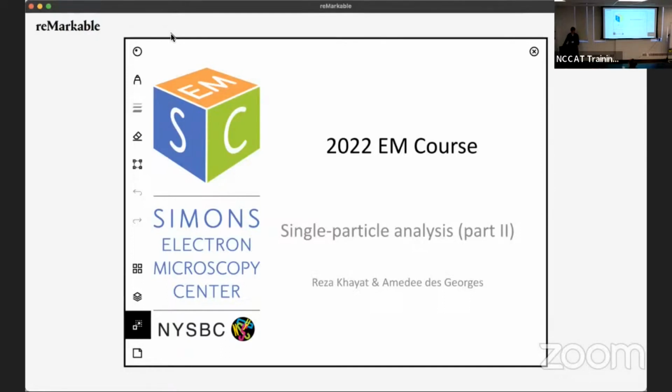So basically looking at the practical aspects of the cryo-EM workflow, there's many programs out there. Like, which one should I use for this task or that task? Why would everybody be using this one and not that one? Because that's kind of what we are trying to do every day. And so I'll give you my personal opinion on those things, and hopefully it will be convincing. And we'll all get beautiful, optimal reconstructions.